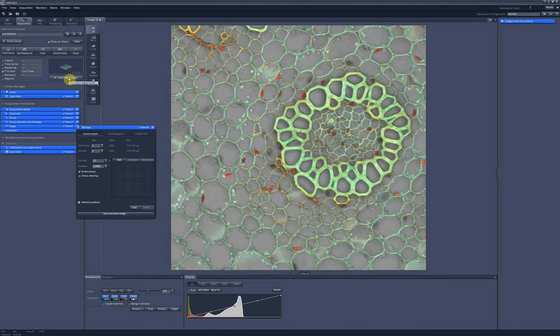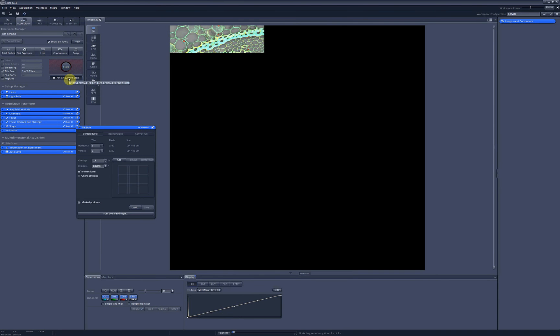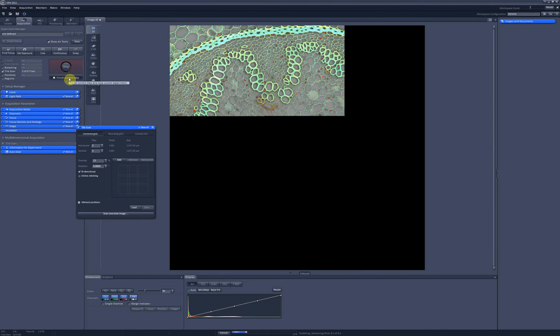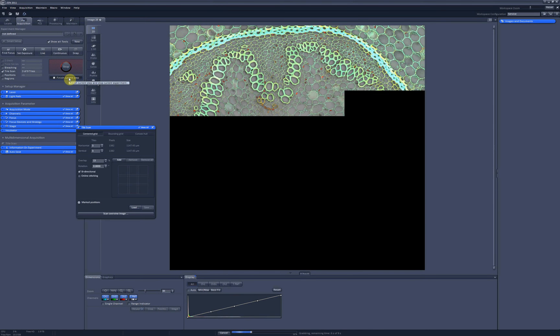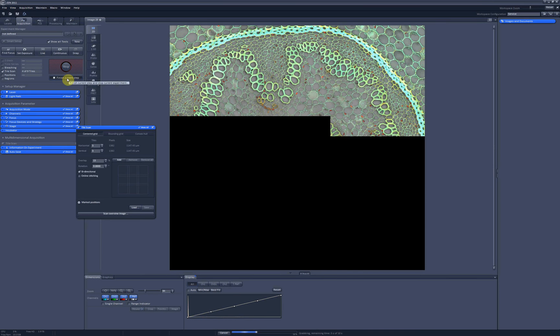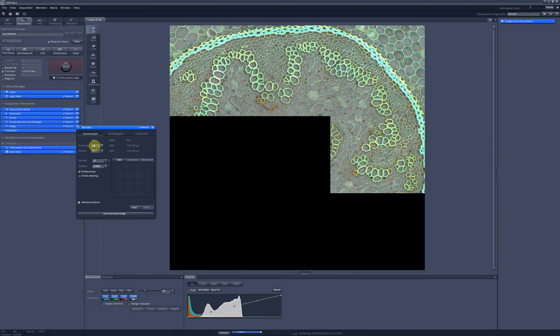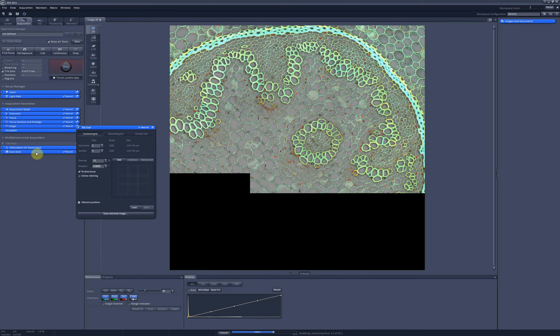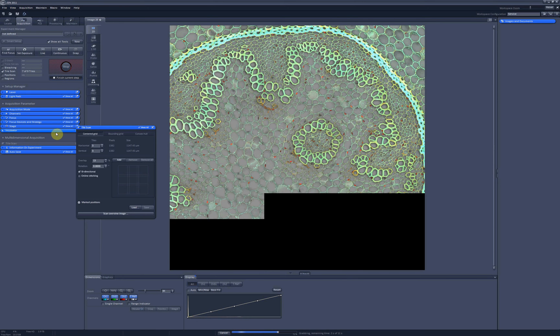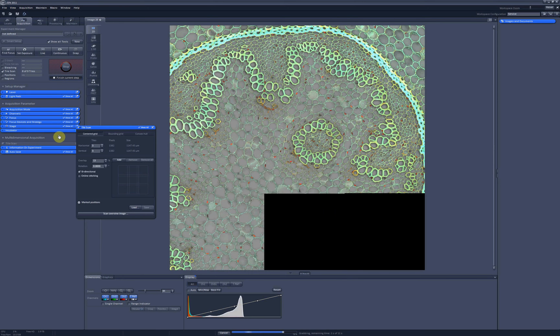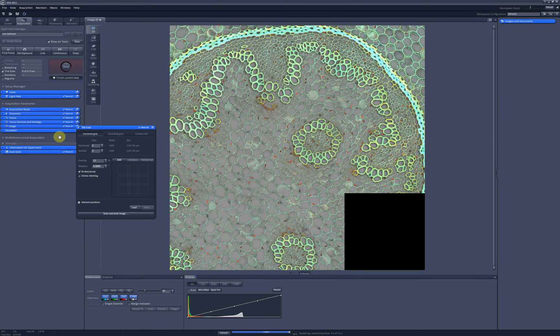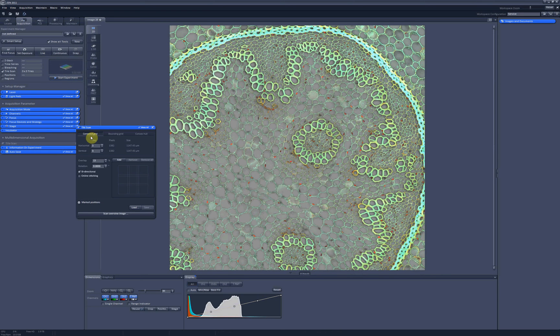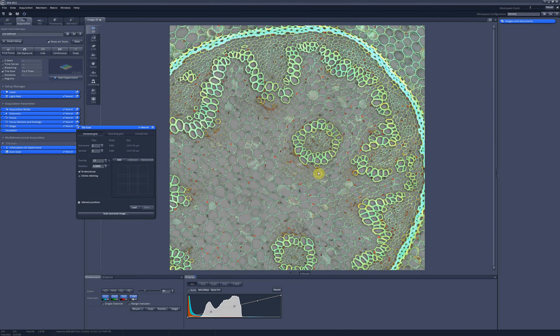And if I click on start experiment, the software starts scanning using the options I selected in the TileScan and in the other tabs over here. And as you can see, the major problem of this centered grid option is that it's very difficult to estimate how many tiles you are going to need to cover your whole sample. And also sometimes you are not as centered as you wish to be.